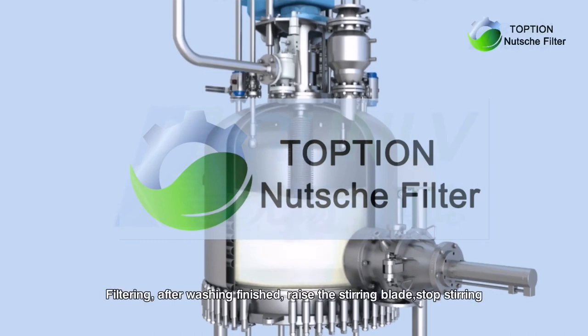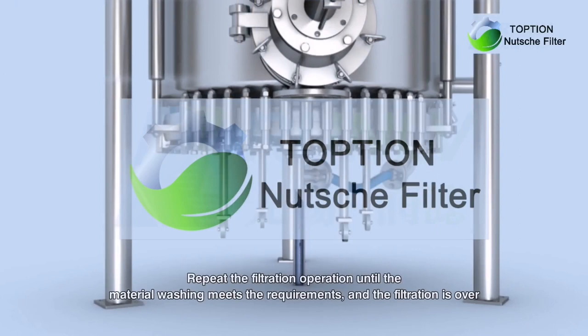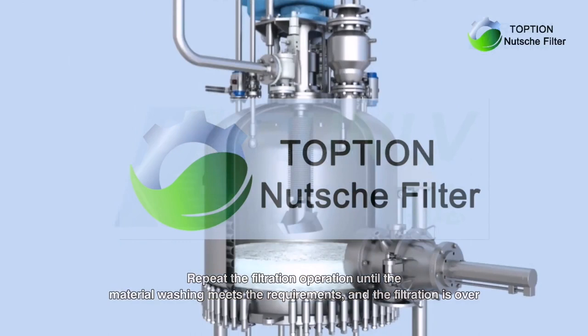Filtering: after washing is finished, raise the stirring blade and stop stirring. Filtrate is drained from the bottom. Repeat the filtration operation until the material washing meets the requirements, and the filtration is over.